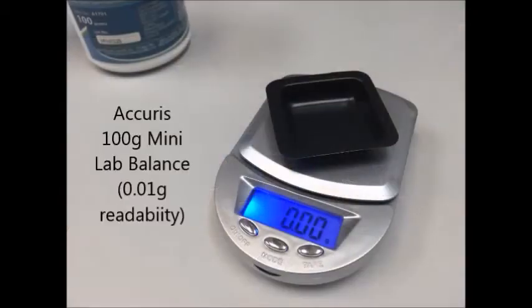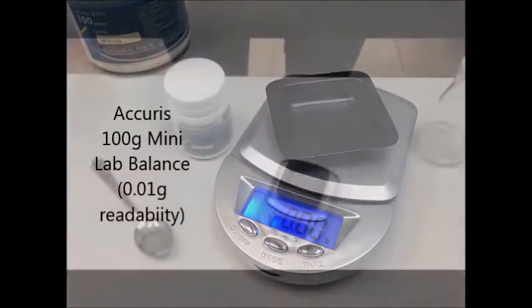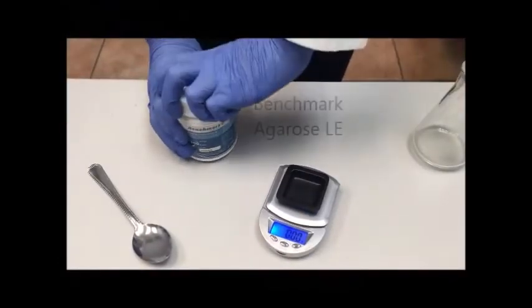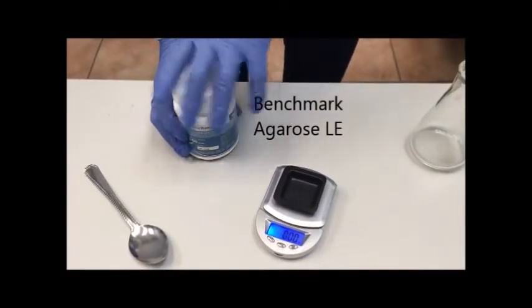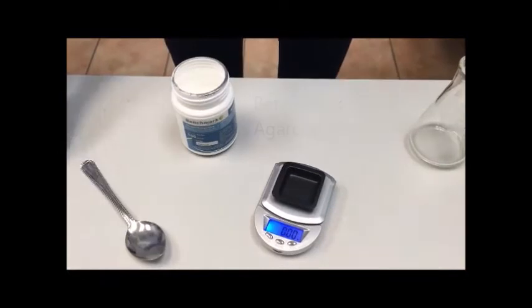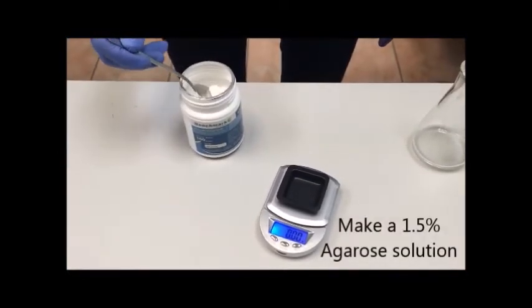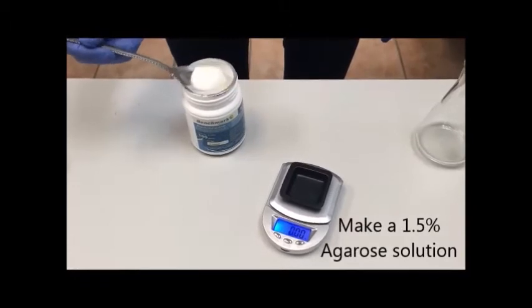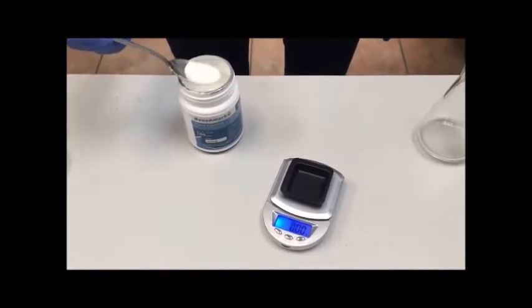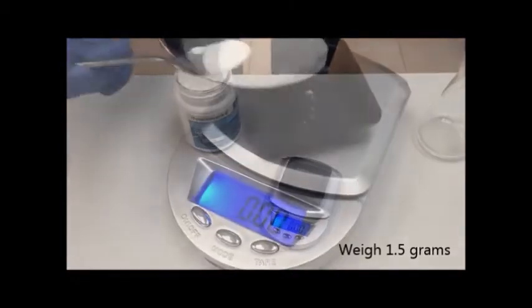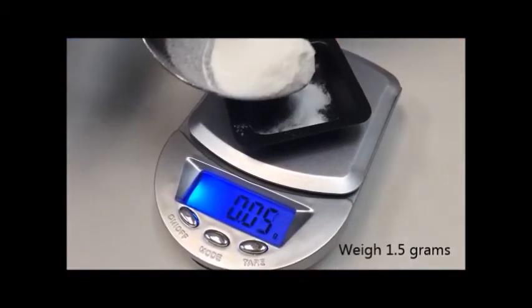The next step is to make our agarose solution. We're going to be using the Acurus 100G Mini Balance to weigh out some agarose powder. Here, we're making a 1.5% agarose solution, which is suitable for the size range of DNA we'll be separating. First, we weigh out 1.5 grams of agarose powder.